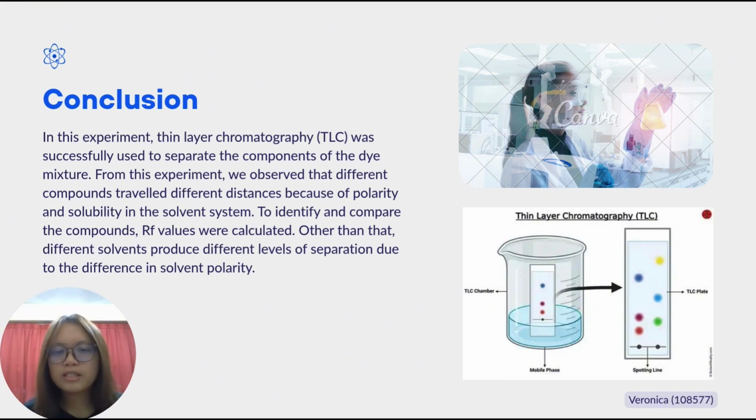To conclude, in this experiment, thin layer chromatography (TLC) was successfully used to separate the components of the dye mixture. From this experiment, we observed that different compounds travel different distances because of polarity and solubility in the solvent system. To identify and compare the compounds, RF values were calculated. Other than that, different solvents produce different levels of separation due to the difference in solvent polarity.